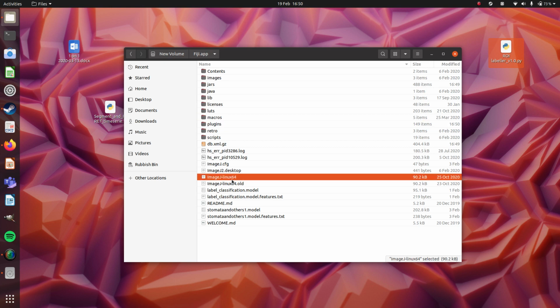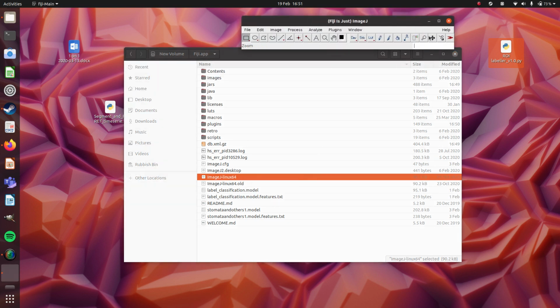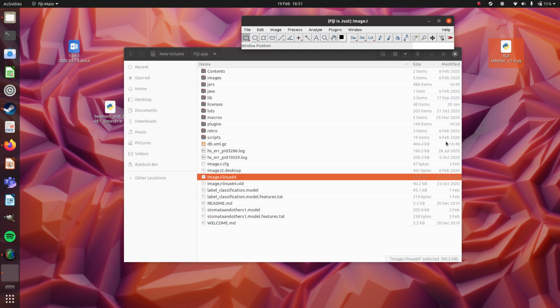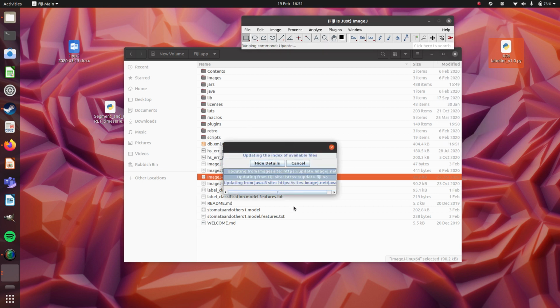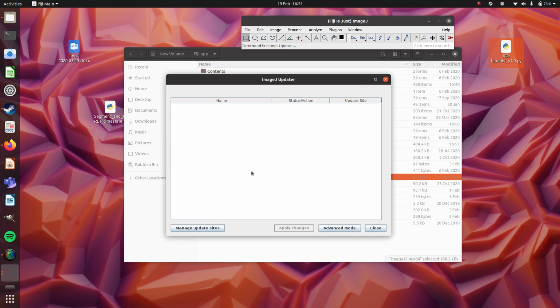The plugin, like the FRETENATOR plugin, does have a couple of dependencies. Helpfully they're the same dependencies, so if you've already installed those, you just need to run an update. So click Help and Update. It'll run through and check through all your plugins to see if they're all up to date, which will take a minute. If there are plugins to update, they'll appear here.